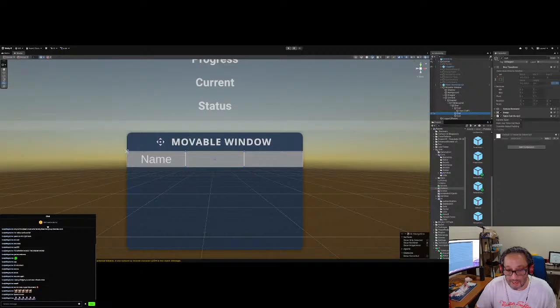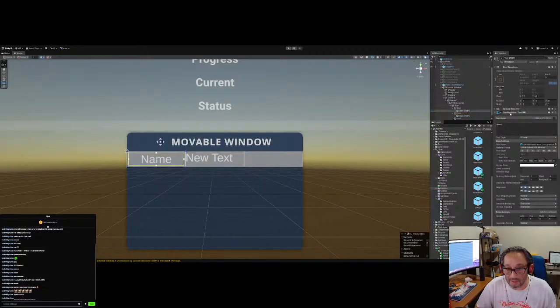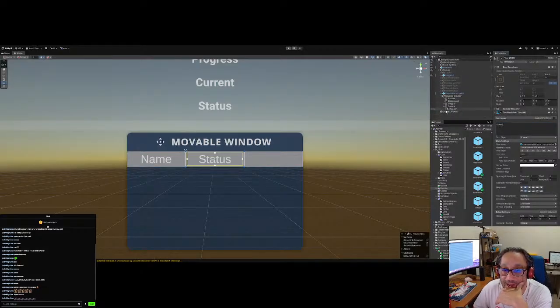And then we're gonna say status, boom, right? So we're gonna right click, copy, paste, values, status. And we do the same for the last one, right? We're just gonna skip that part. I'm kind of lazy today. All right. So then you have the actual content.